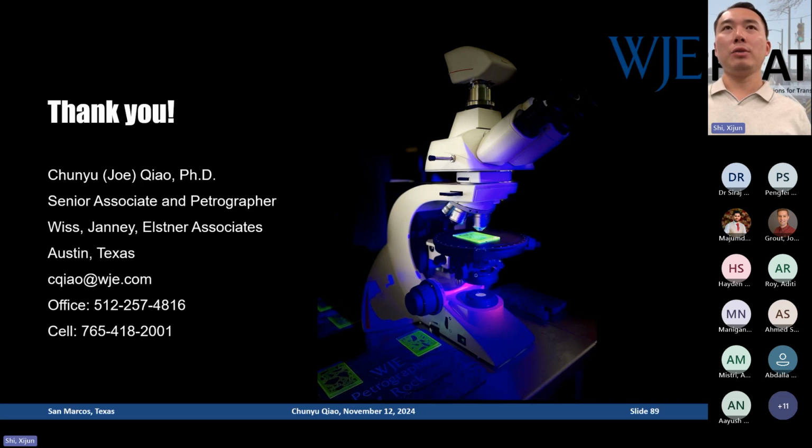And then we use computer programs to set up our sample and calculate the spacings for the point count. We have an XY auto stage with a controller for the point counts. So we just evenly distribute the required point counts in the specific area required by ASTM C457, and start to do the point count on the computer.